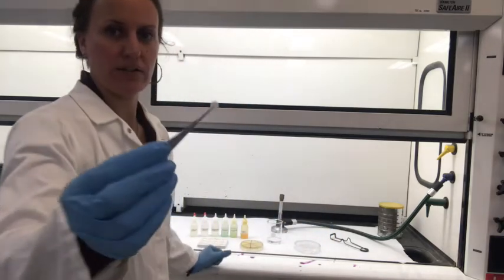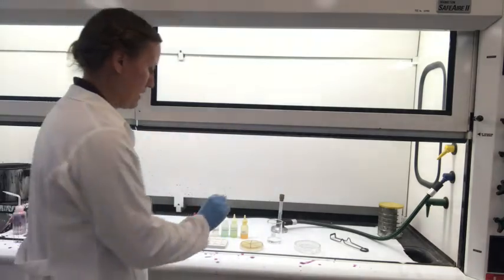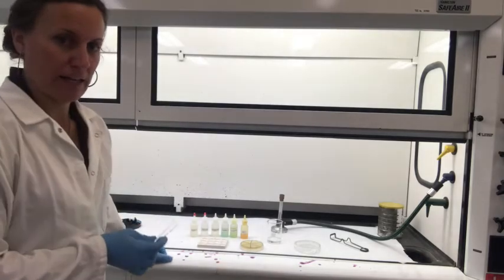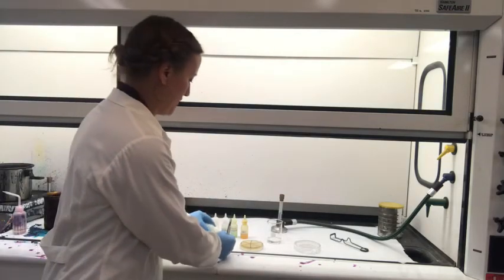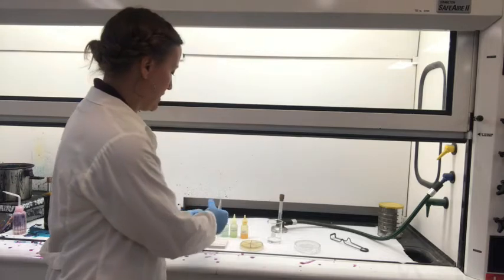And these discs are just very small pieces of filter paper. I'll put this disc in my first dropper dish here, and I'll add my first disinfectant. So for example, I'm adding bleach to this one. I'll simply put a drop of bleach into this to saturate the disc.